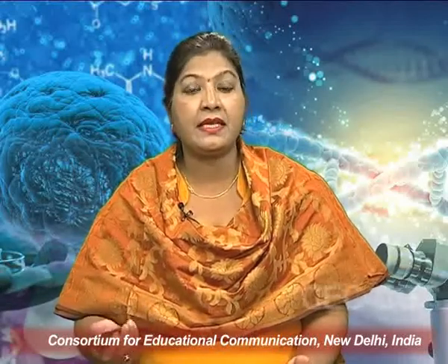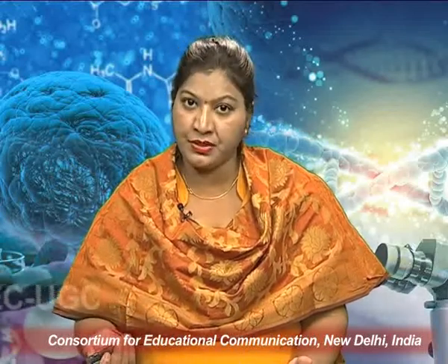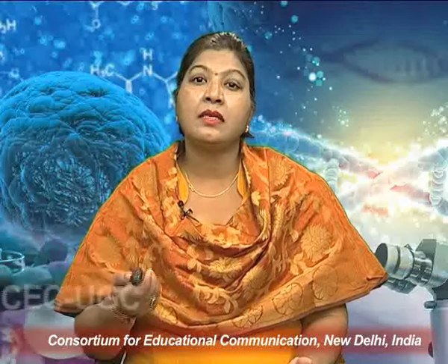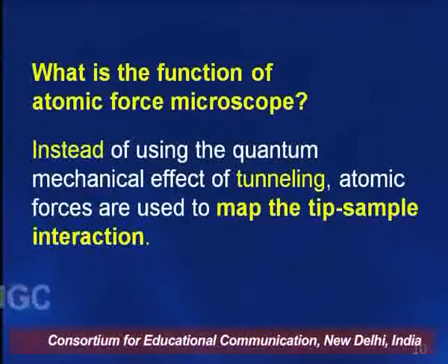We can get the topography of the surface. So these are the basic applications of the AFM, and AFM is used to investigate these properties of the surface and the forces within the molecules. Moreover, we can scan a single molecule by using the AFM. Next, what is the function of atomic force microscopy?